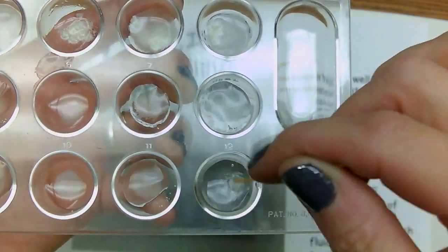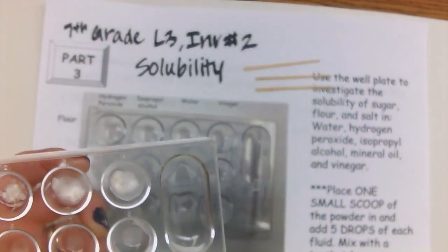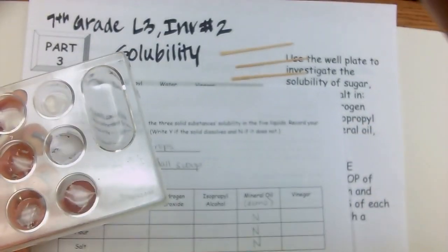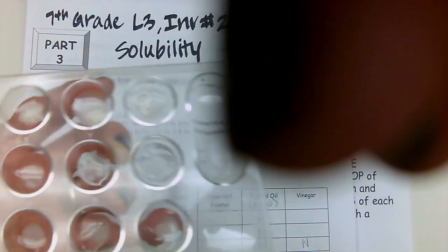I still definitely have some salt left in there, so I'm going to say no for that one. And what you're going to do is fill this out. Okay. So for vinegar and salt, you're going to go no.